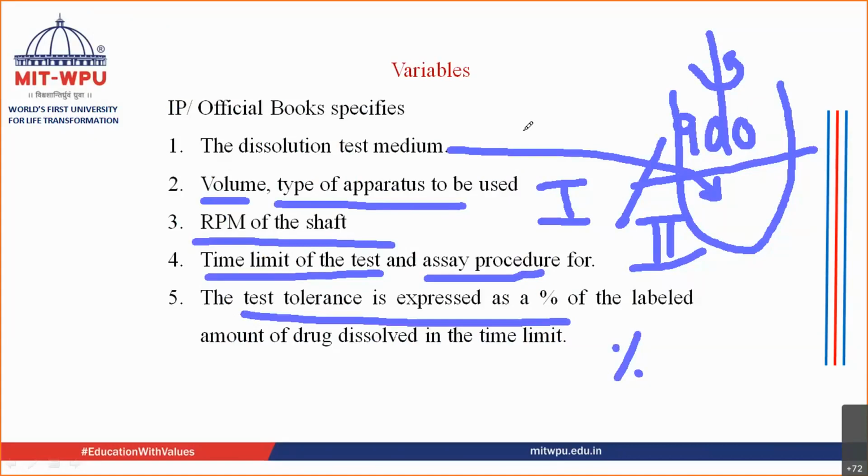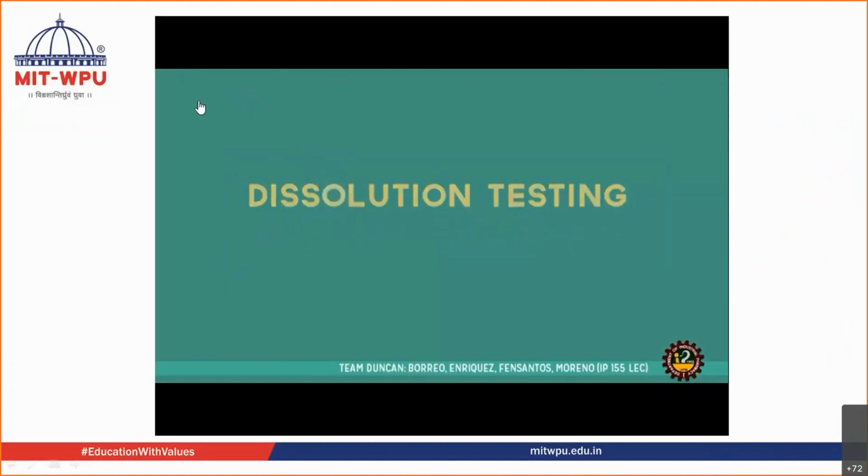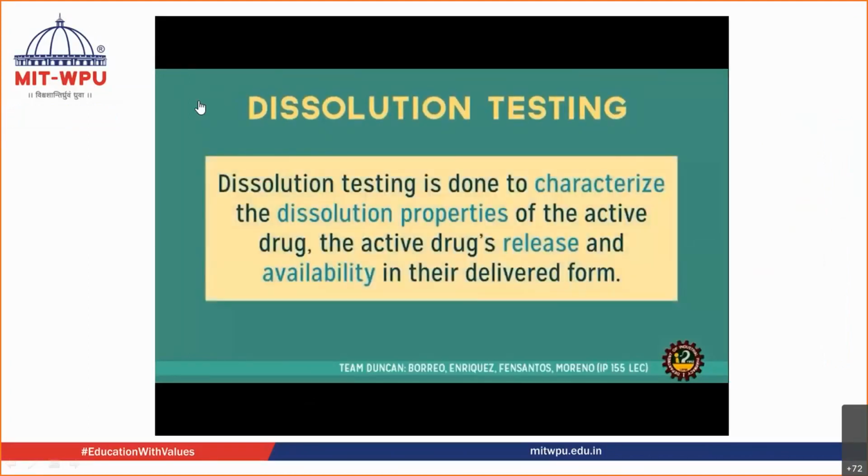The only difference is that over there you are going to dissolve your drug. You can break your drug, you can dissolve your drug, and then you are going to evaluate the procedure, right? And that is not with respect to time. Dissolution test is with respect to time. That is the main difference between the content uniformity test and your dissolution test. Moving ahead, let us see the working of this. Let us see the video of how you carry out the dissolution test.